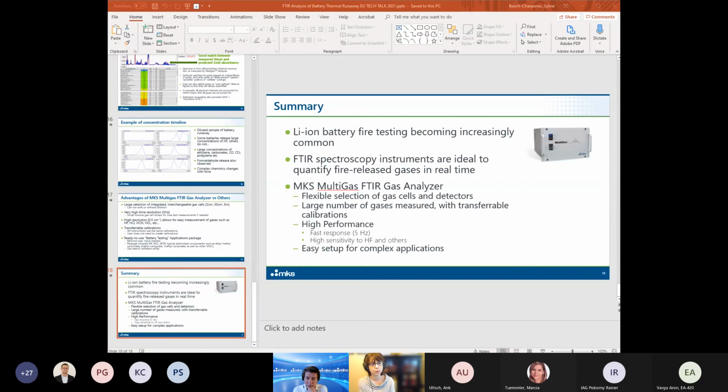In some cases, we've seen that if there is sulfuric acid in the gas phase, with a little bit of water, or if the temperature or pressure conditions are such that it starts to get into mist, this can condense on the mirrors even at 191, and then we've seen degradation of mirrors. But HF, HCl, HCN, all of those are in gas phase, and it's not a problem for the analyzer.